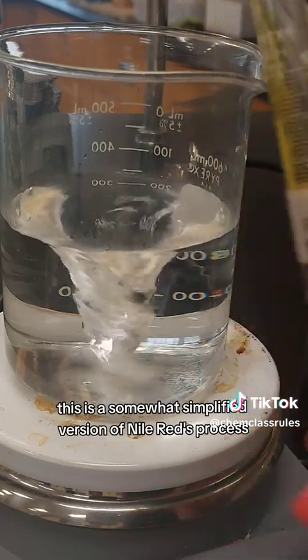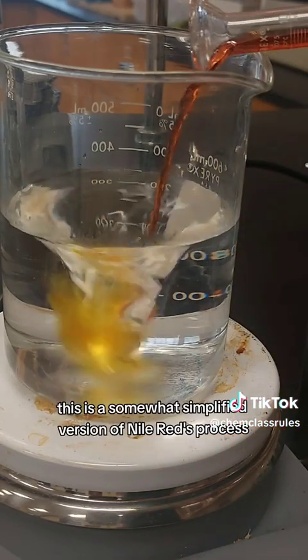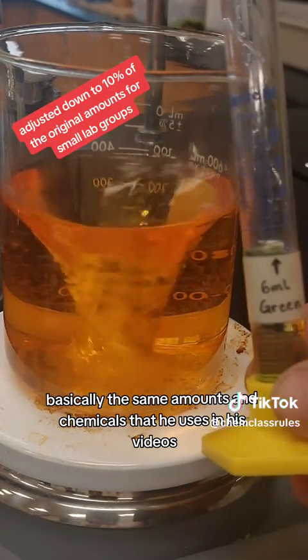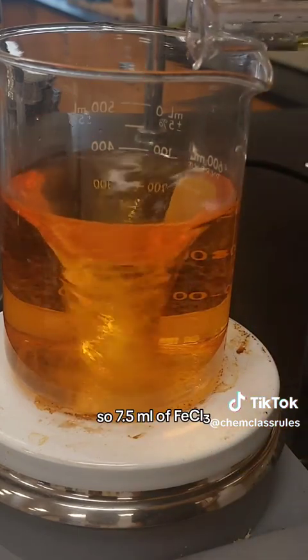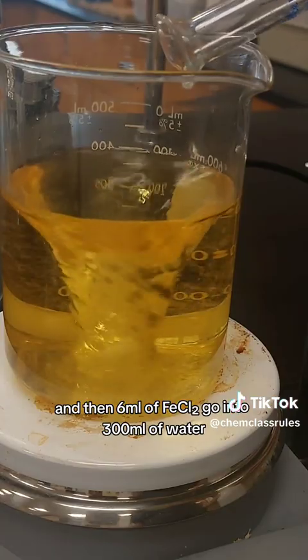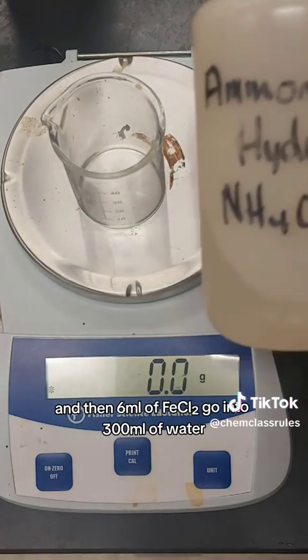This is a somewhat simplified version of Nile Red's process, so we're going to use basically the same amounts and chemicals that he uses in his videos. Seven and a half milliliters of iron(III) chloride and then six milliliters of iron(II) chloride go into 300 milliliters of water.